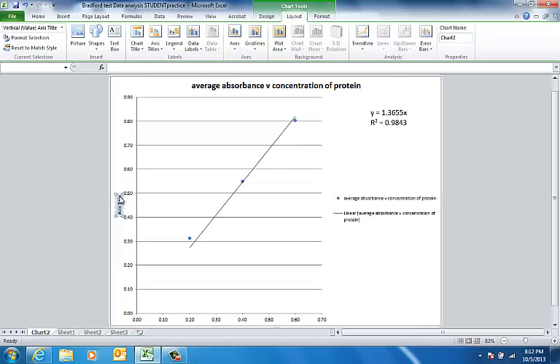So this is absorbance, and the uncertainty of our spectrophotometers is plus or minus 0.001. Notice there are no units associated with absorbance. We just call it the absorbance, but you should specify at what wavelength the absorbance was taken.